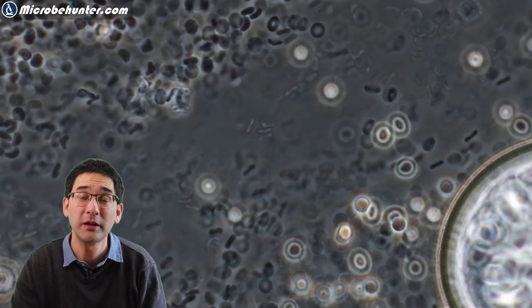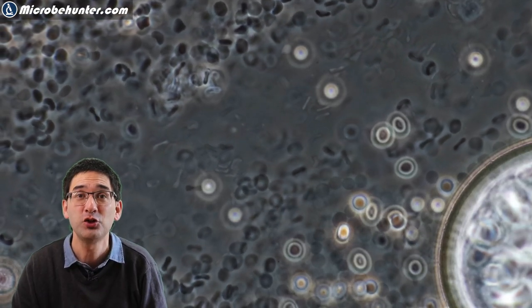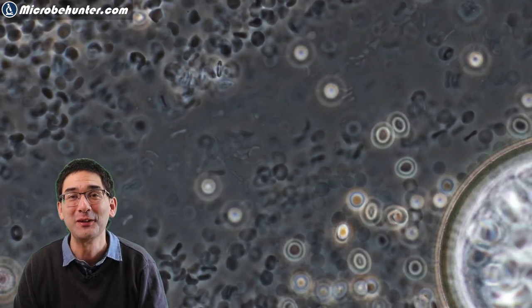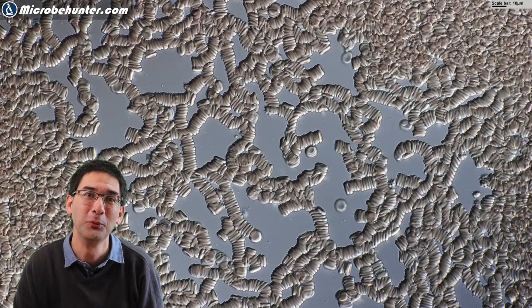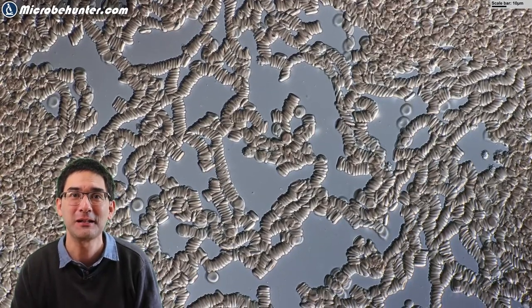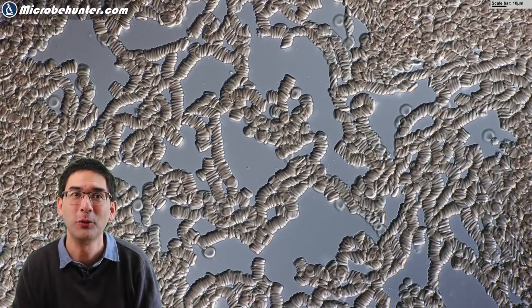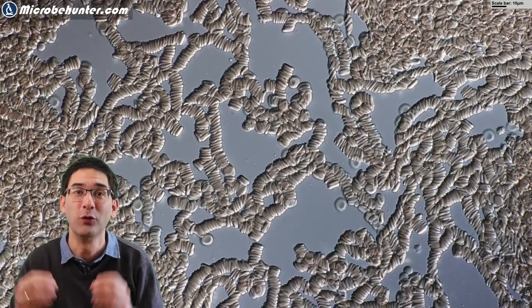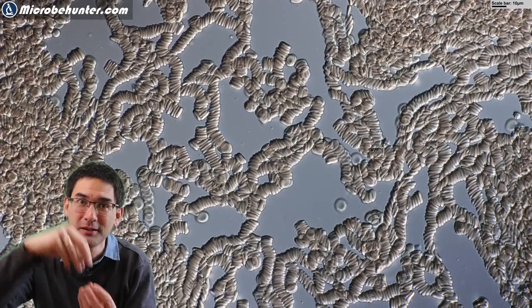When you look at blood, you always have to be careful and observe hygienics. Do not do this if you're a teacher in school, because when you have an open wound, there's the possibility for infection and students sometimes are not very careful. Here again, the red blood cells as they are seen normally under the microscope. And you can also see again this nice rouleau formation where the cells are stacking up like those stacks of coins.